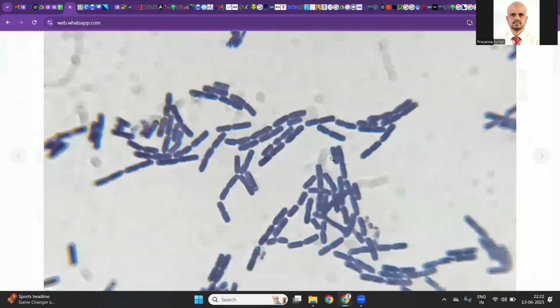This is a perfect picture, I would say. A perfect gram staining picture. You see, everything about this picture is okay, and it is also mostly because the volume of gram-positive rods here is much thicker.